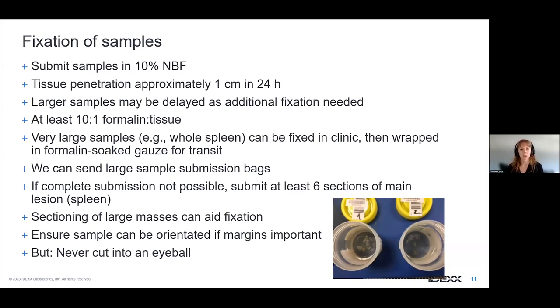And we are aware that there are samples that, for several reasons, might be really difficult to complete as a whole, which can be a spleen or a whole leg. Something I will come back to as well is that there is always a pathologist on duty that you can call and talk to, and ask us questions.